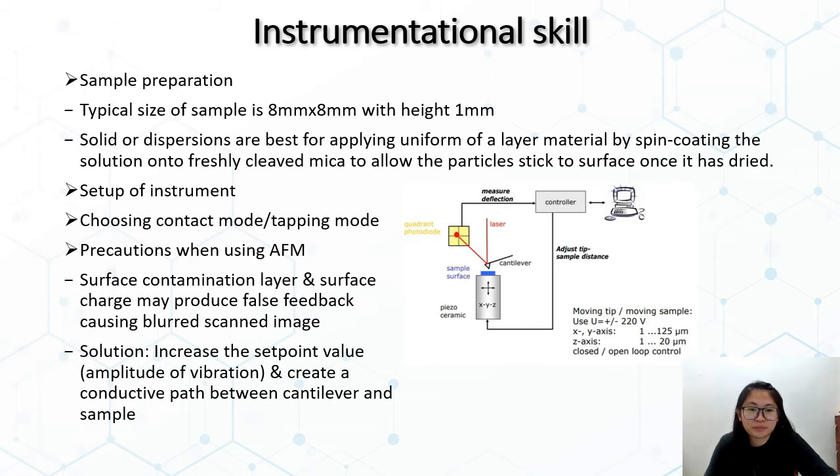Besides, there is another precaution we need to take note of, because the image quality will also depend on the tip size and shape. If the tip is not perfectly sharp, this may not provide the best aspect ratio of the image. Besides, if the tip is blunt or broken, this will cause a false and poorly constructed image.